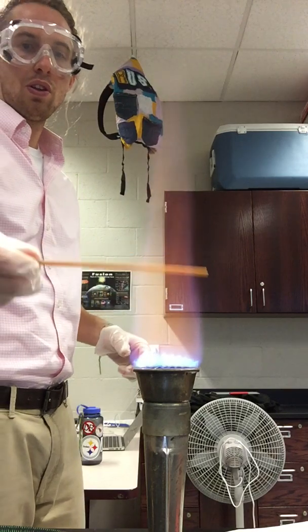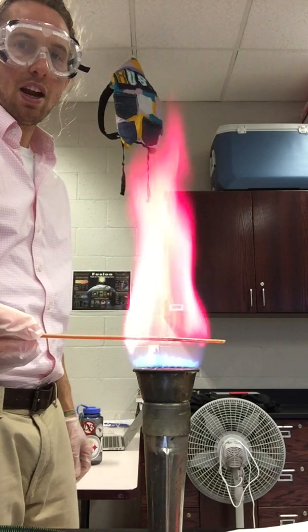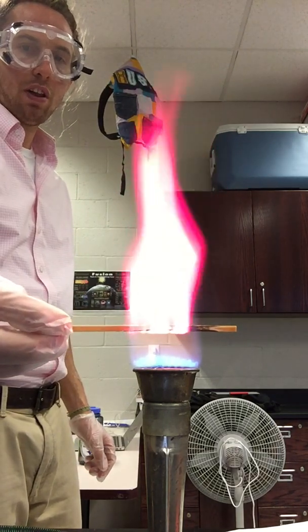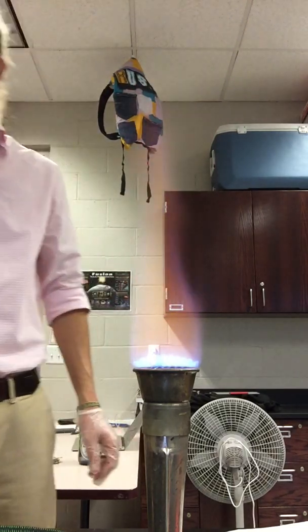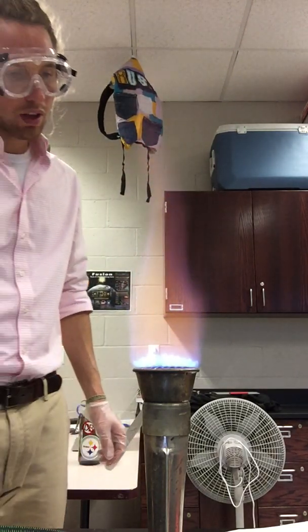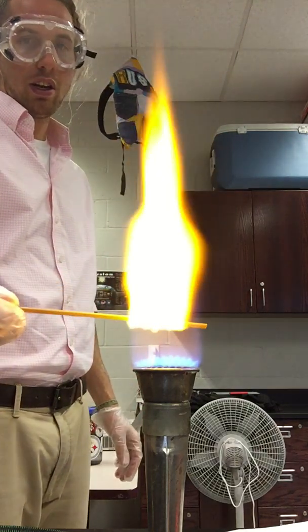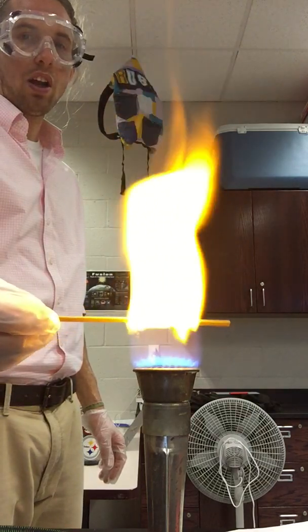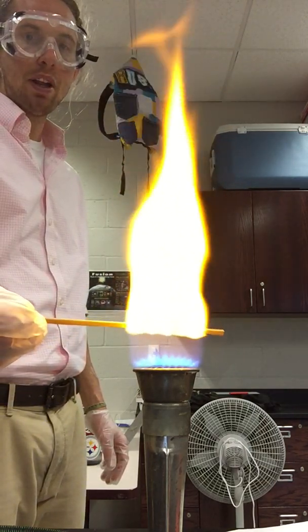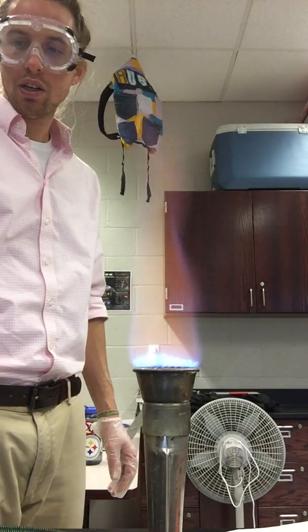Sample number 2 looks like this. You can see some red there emerging. I even see some orange in the middle of the flame, so that's maybe a reddish orange in number 2. Number 3 looks like this. Here it comes. You can see that's a bright flame, almost like a goldenrod color. It's not super easy to see on the iPad, but I'd say kind of like a goldenrod color there.